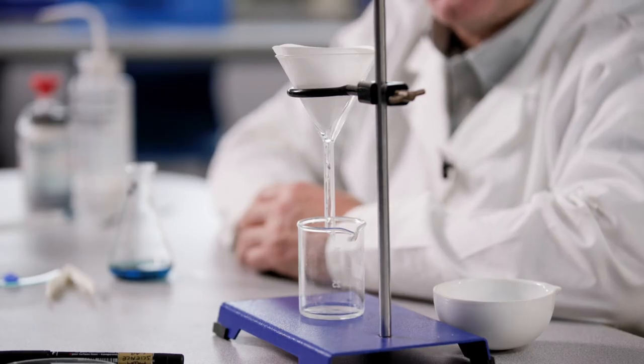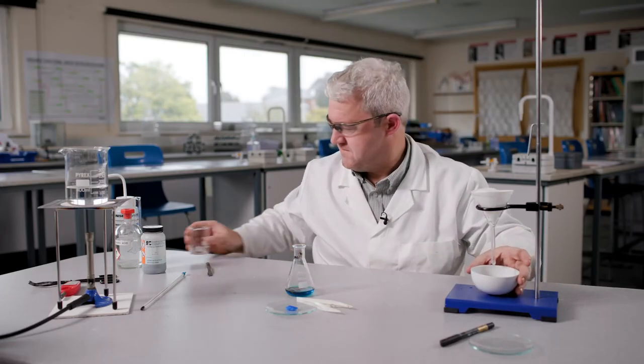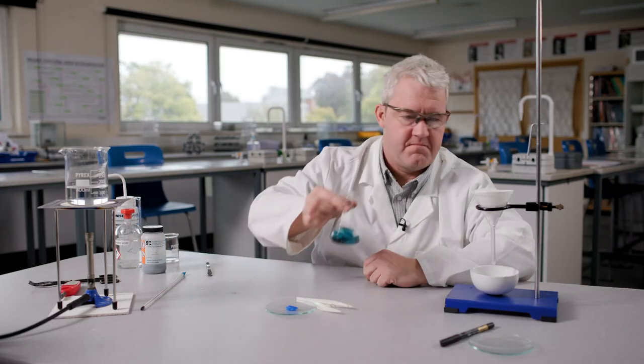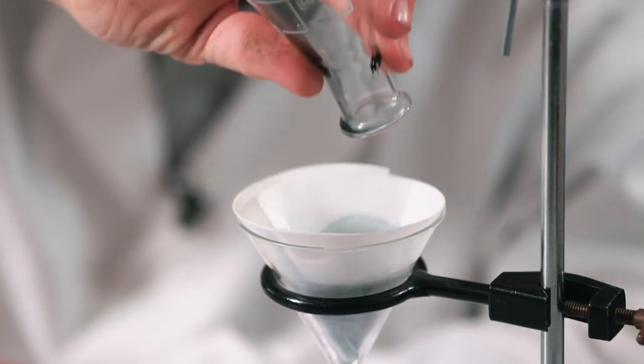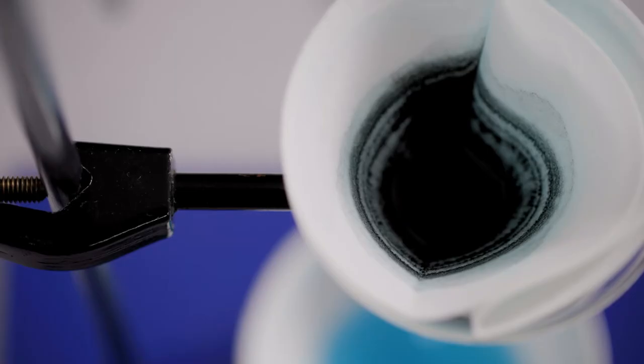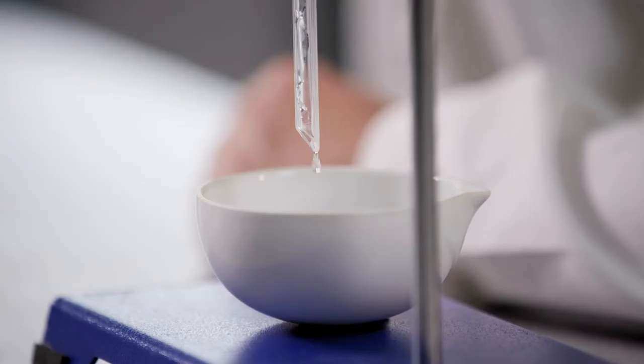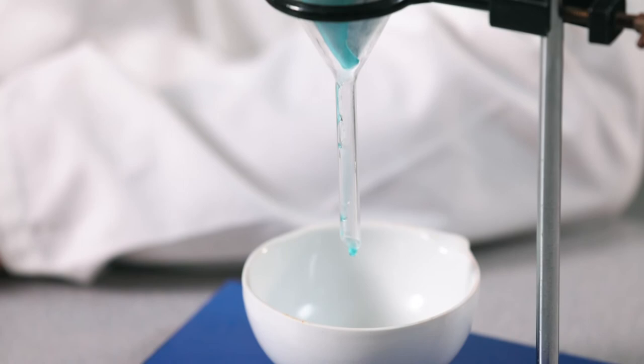Alternatively, the funnel can be lightly clamped with a conventional clamp. Pour the reaction mixture into the filter paper, taking care not to overfill beyond the line of the paper. Depending on the thickness of the filter paper and the amount of excess copper oxide, it may take a few minutes for the copper sulphate solution to pass through the filter and be collected in the evaporating basin.